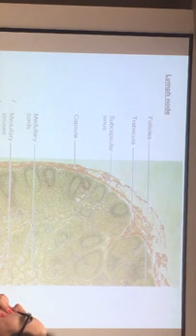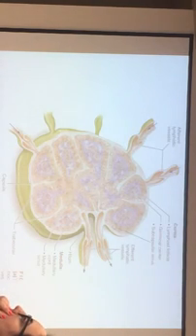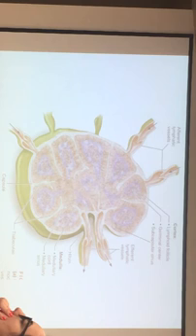And the medulla is in the center. Maybe this one is better. You can see the cortex always has some nodules, with dark color and light color. They all belong to the cortex. The medulla also has dark color and light color. They all belong to the medulla. And this one especially has two different vessels, divided vessels.